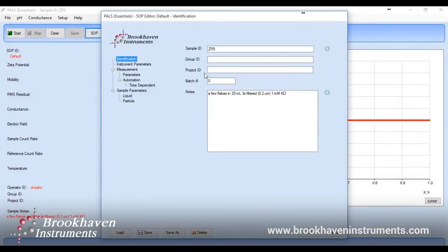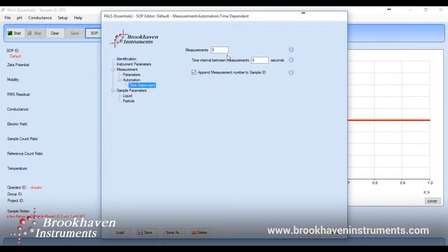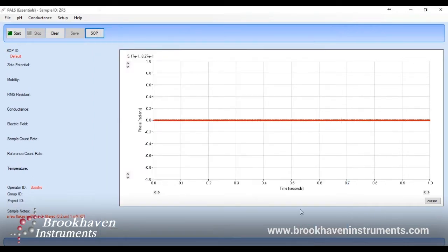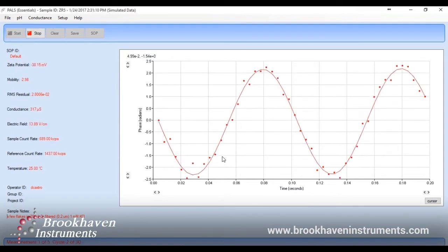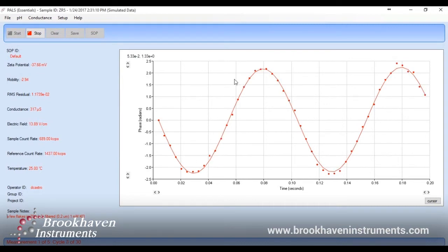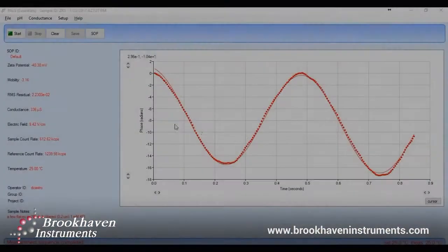Using the software suite Particle Solutions, we will set some basic parameters such as sample ID, preparation notes, measurement length, and important parameters about the sample. Once this is completed, we can begin the measurement. Click the start button and the measurement will begin collecting live data. The phase shift curve is immediately seen and averaged out as data is collected over time. You can also see the live measurement of zeta potential and mobility throughout the measurement.